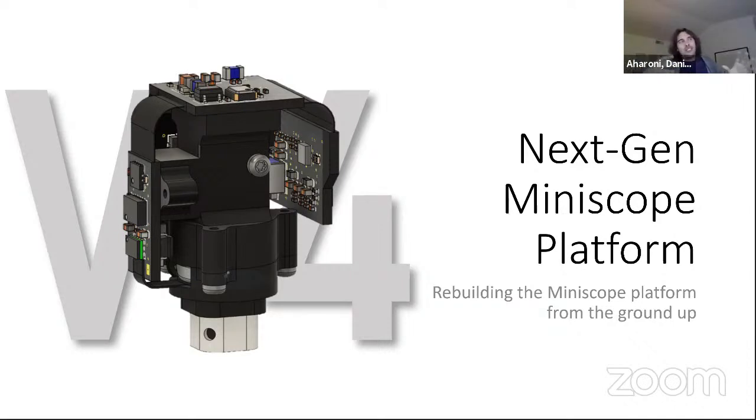For this kind of epifluorescence single photon imaging, while maybe 5 or 6 years ago we would use some measure of delta F/F, our baseline fluorescence cannot be detected as the baseline fluorescence of an individual cell like you would do for 2 photon imaging. Our fluorescence is all this background fluorescence from out of focus cells and neuropil. So we really don't have a good measure of F. So all the processing that's done on this imaging data tries to remove the background and doesn't convert the image to delta F/F.